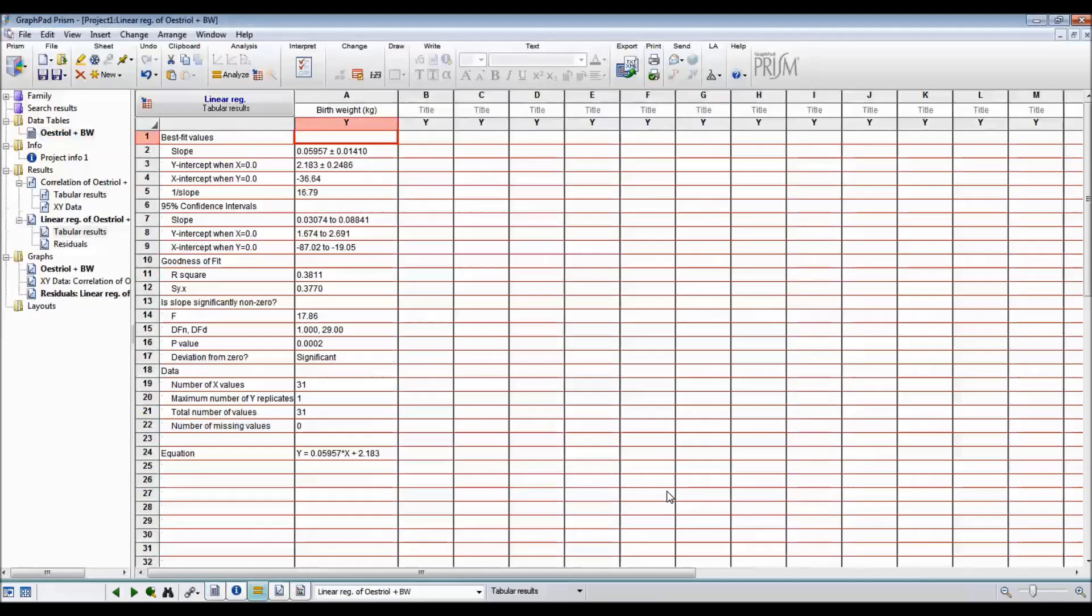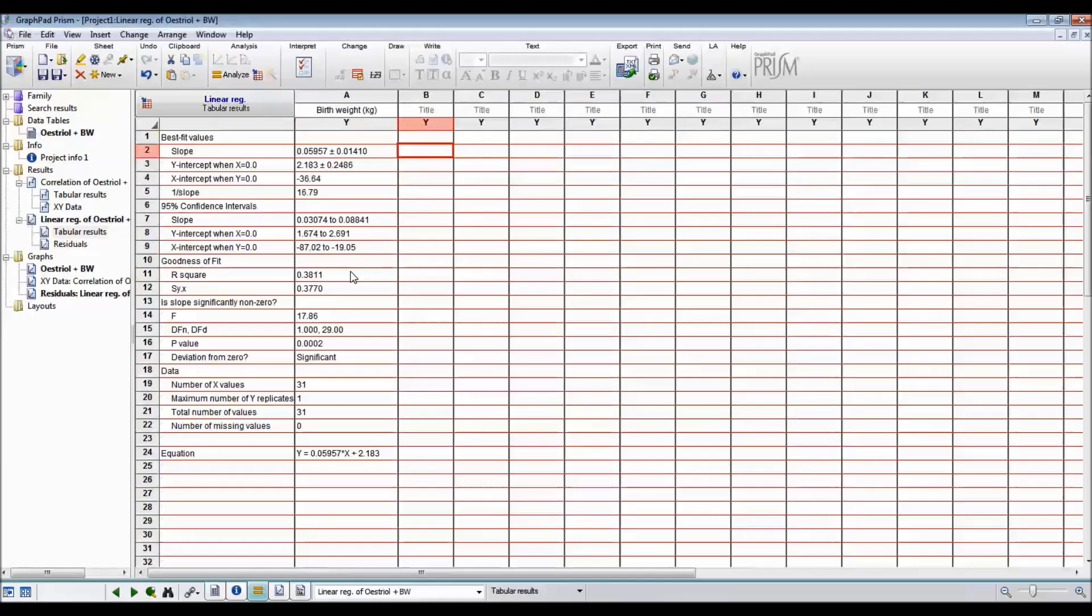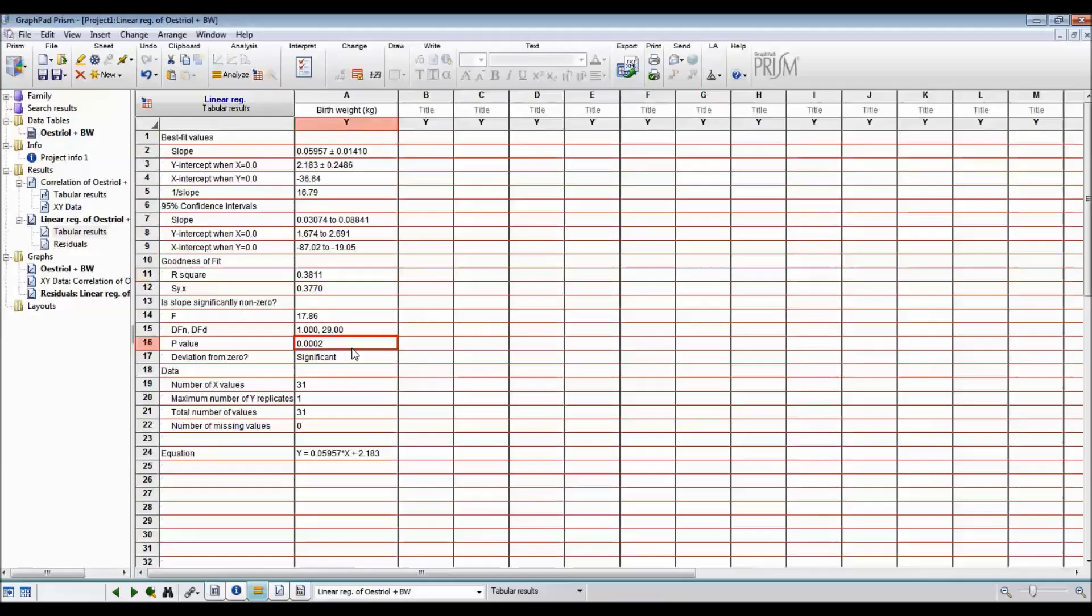There's lots more data that comes out from this analysis. There's the slope. That's the beta coefficient plus or minus the standard error. There's the R squared, which is the coefficient of determination. That says how much of the variation in Y, which is birth weight, is explained by the equation. There's also a test to see is the slope 0 or not 0. And you can see that the p-value is much less than 0.05 and it's significant. So that means that the slope is not 0.